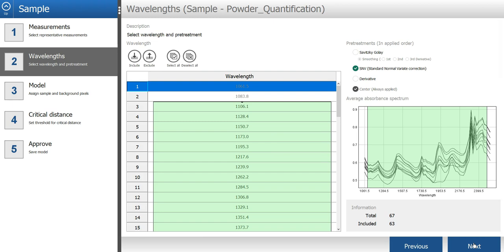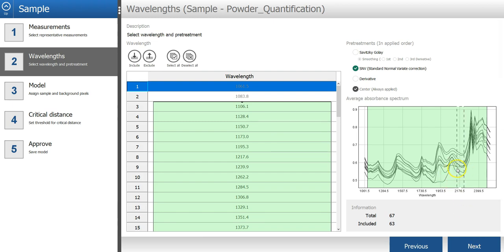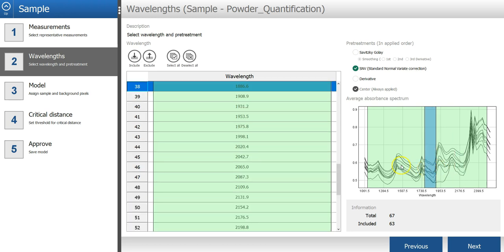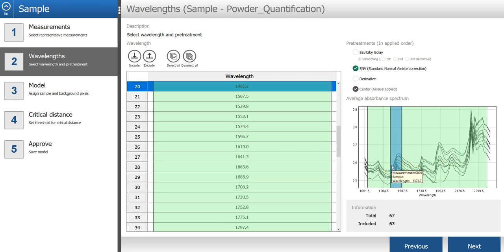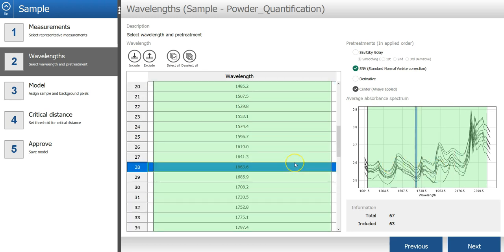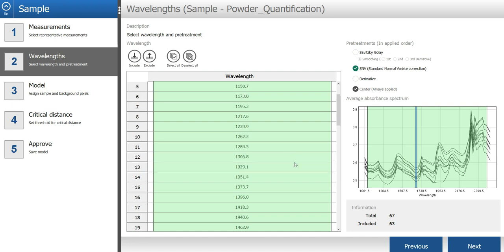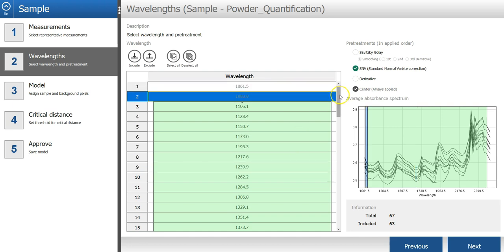In the next step of the wizard, I can select the spectral bands or wavelengths that I want to include in the model. In this case, all wavelengths are included except the first two and last two, which is okay.